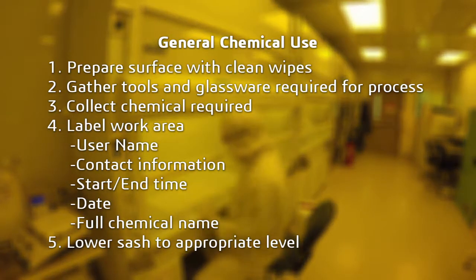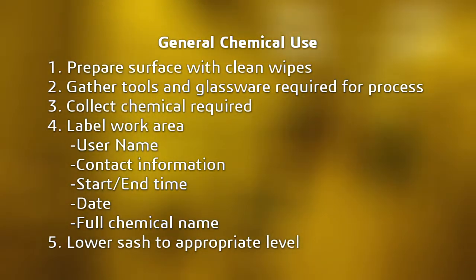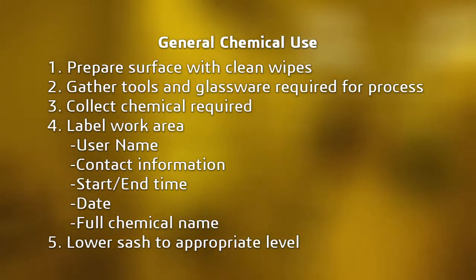In summary: prepare the work surface, gather tools and glassware, stage required chemicals, label the work area, and lower the sash to the appropriate level.